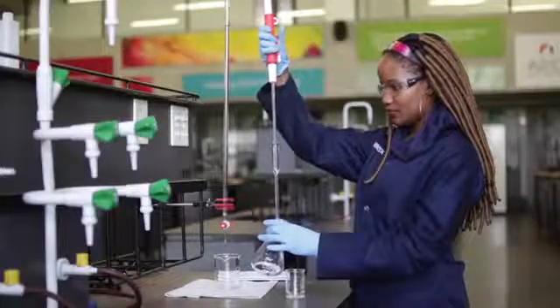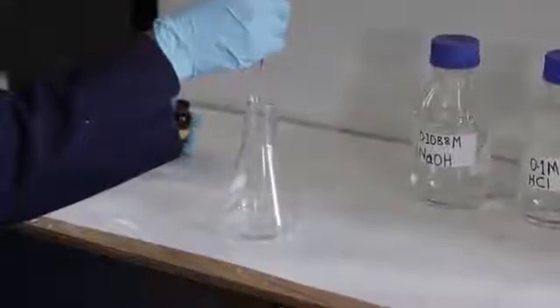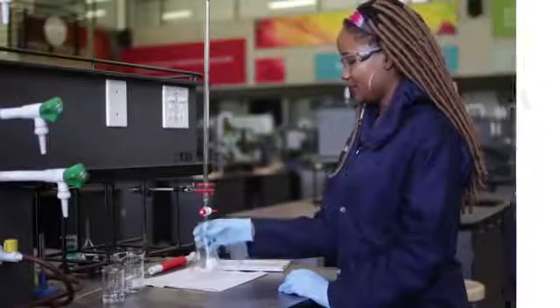The analyte solution is pipetted into the conical flask and then a few drops of the indicator is added. The conical flask is then placed under the burette.